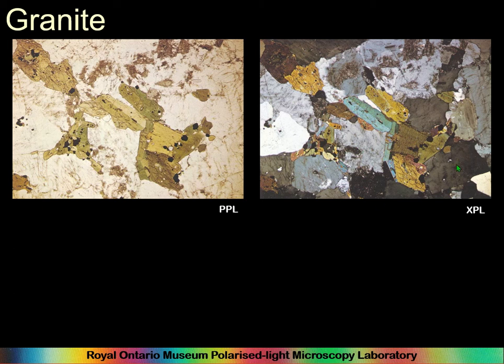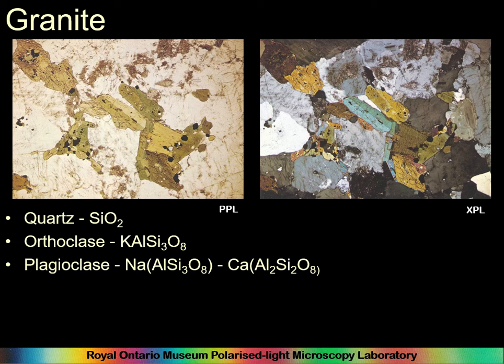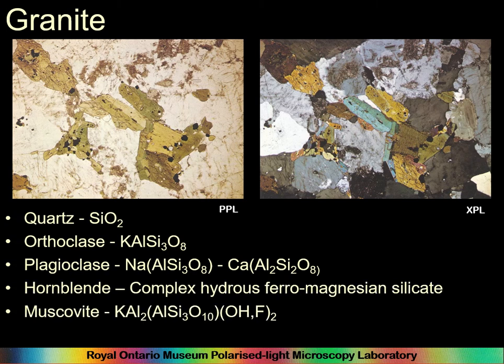Kind of difficult to determine the differences between them at the moment, but if this was actually under a microscope, you'd be able to look at it closely to see this, for instance, looks like it has cleavages. I can't see any twinning, so it's probably orthoclase. This looks like it has fluid inclusions, possibly, and so this must be quartz. And so you'd be able to work out what kind of rock that is by seeing how much of each mineral is in it. Quartz, orthoclase, plagioclase, hornblende.